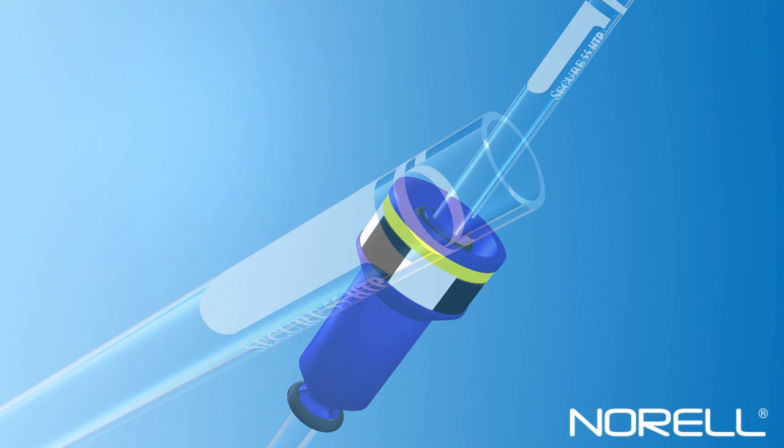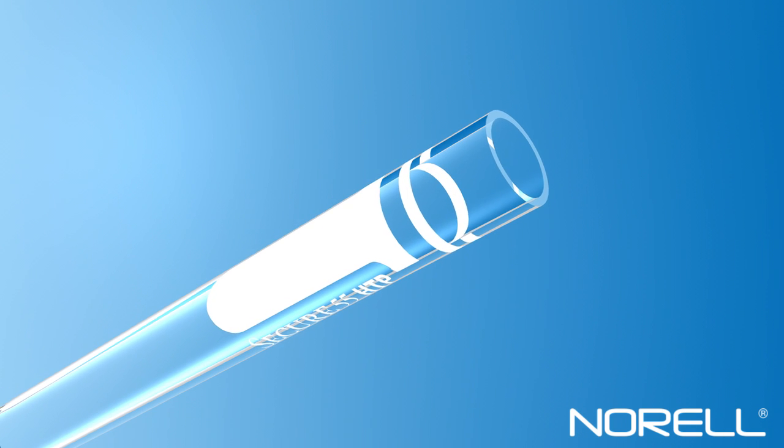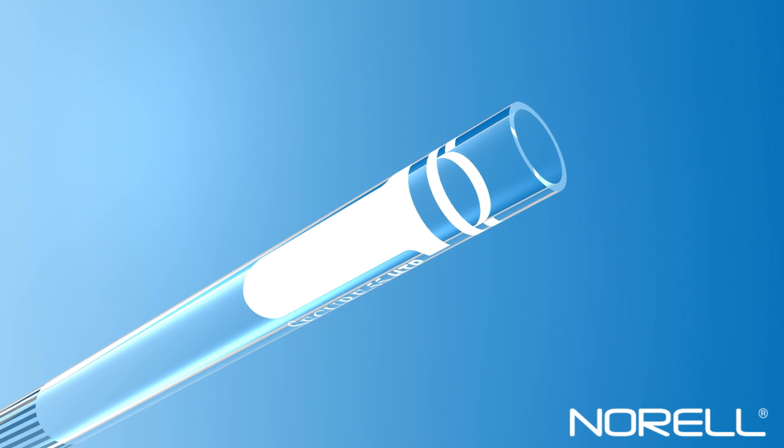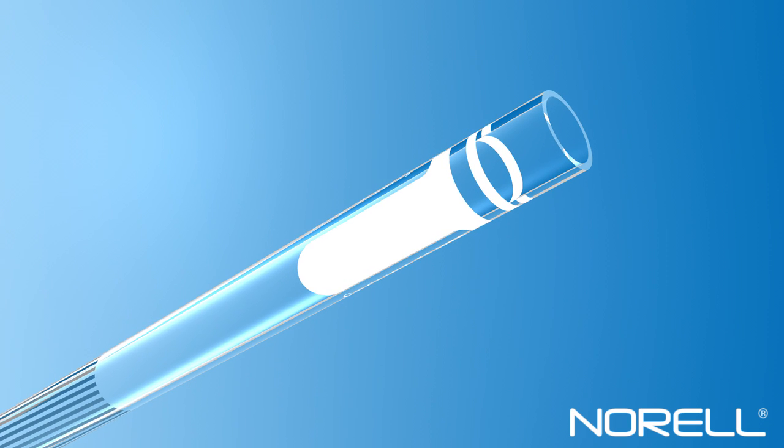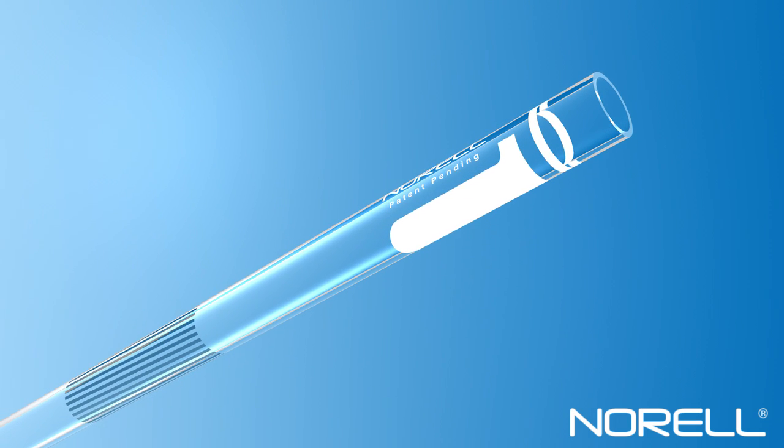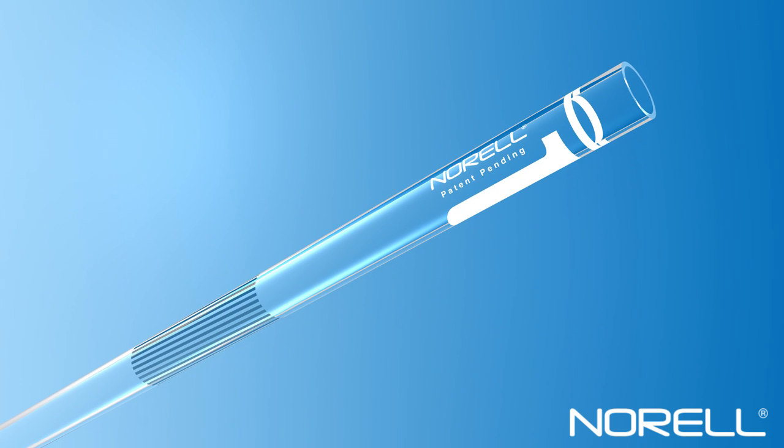The Secure Series NMR tubes are available in two types, the Secure 33 Series and the Secure 55 Series in both 178 mm and 203 mm lengths.